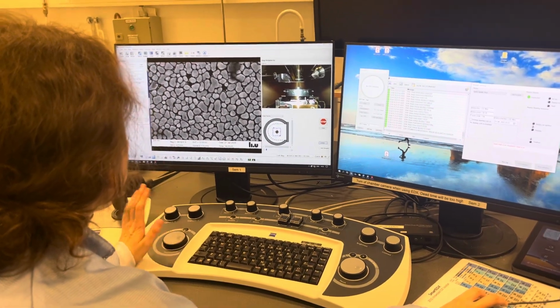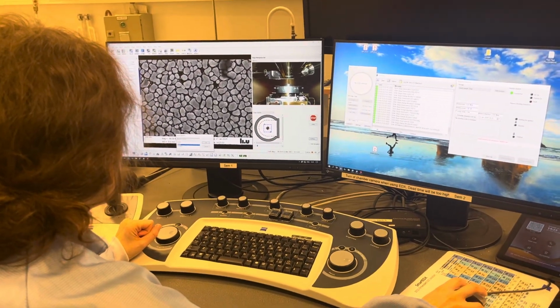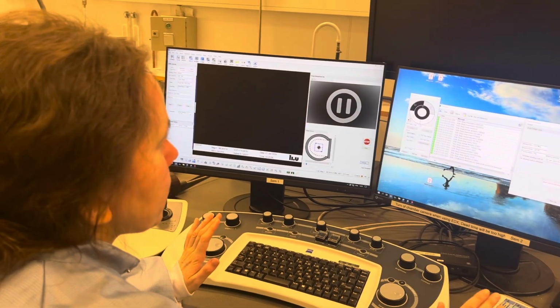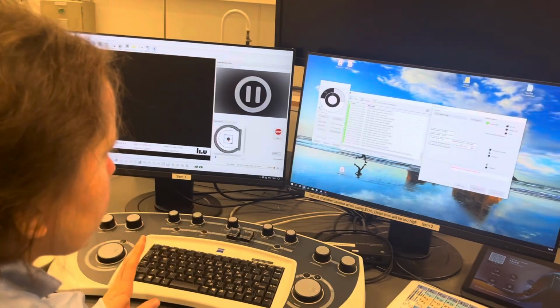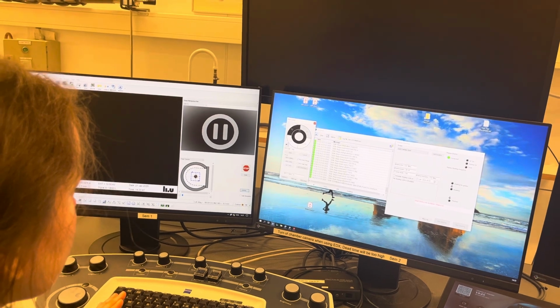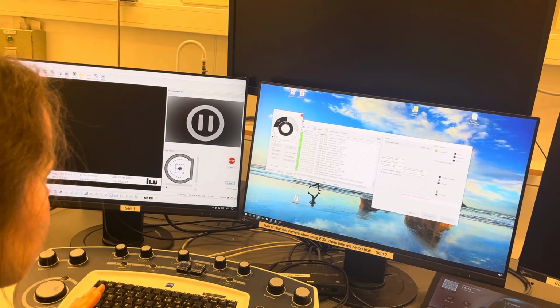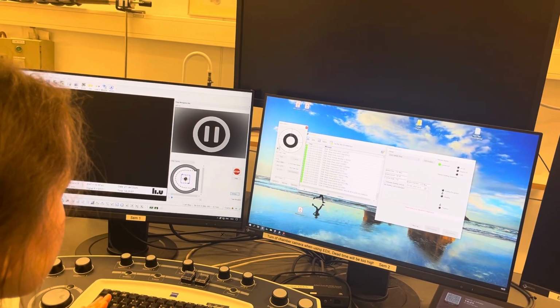Yeah. Okay, and then what you do here, you click here signal A, BSD1. And here, so this detector is so-called sector detector. So what does it mean? That it has different sectors. So here, white color means the sector is on.